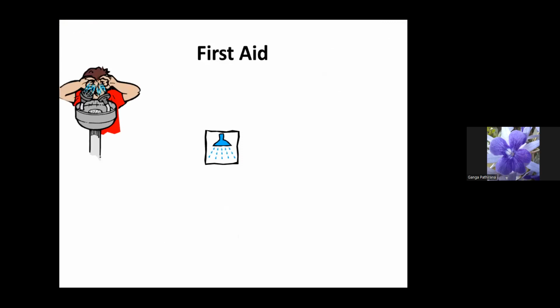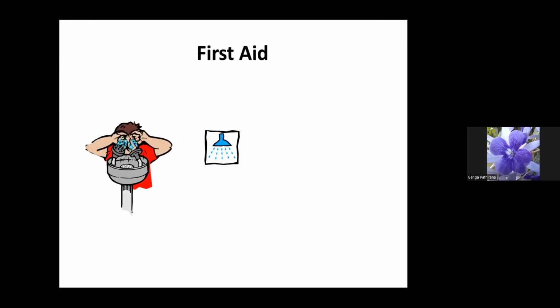As first aid, there should be eye showers, body showers in the laboratory. These should be available.